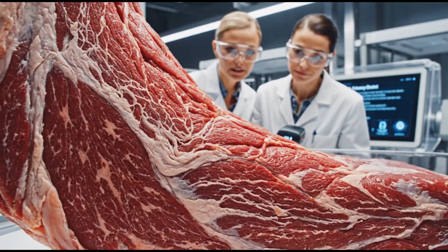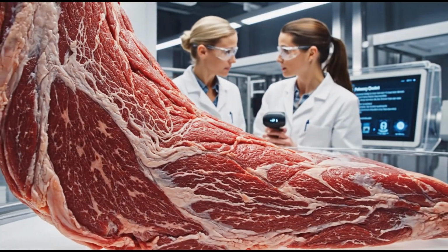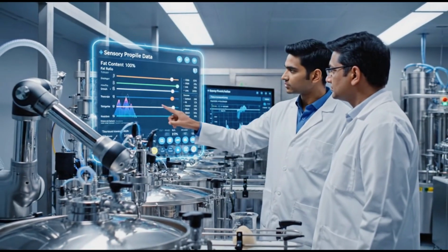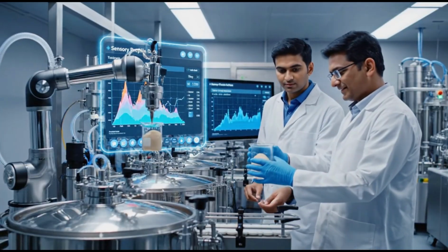The marbling patterns are appearing clearly now. Yes, the fat integration within the muscle structure is nearly complete. It looks appealing. The ratio adjustments are done through the digital controls, fat content adjusted precisely. And no manual handling required.